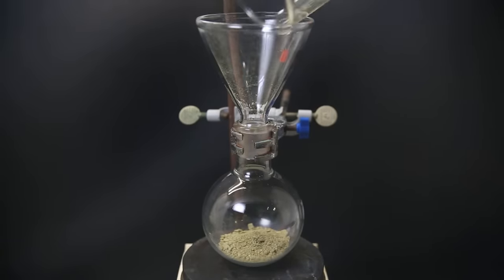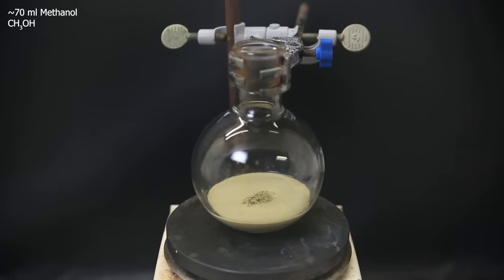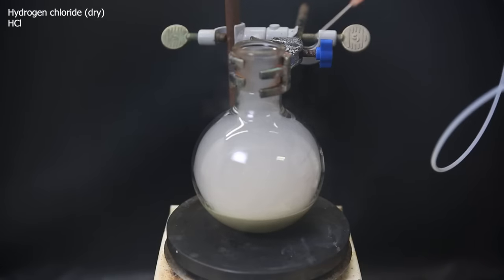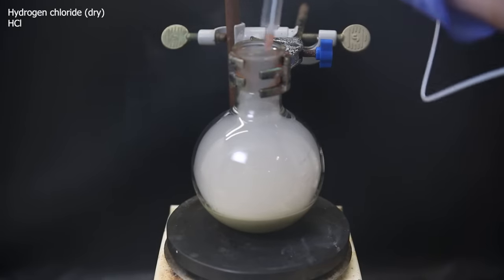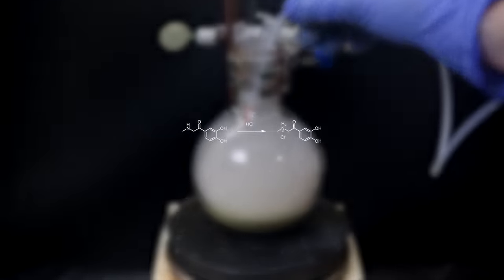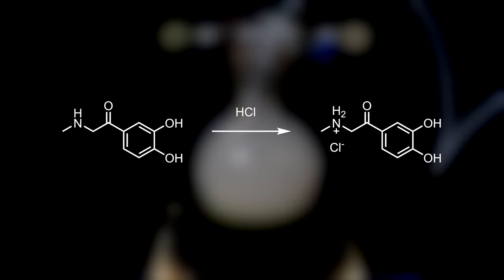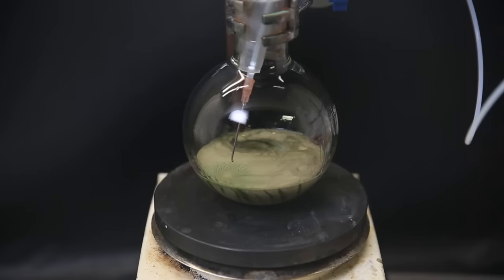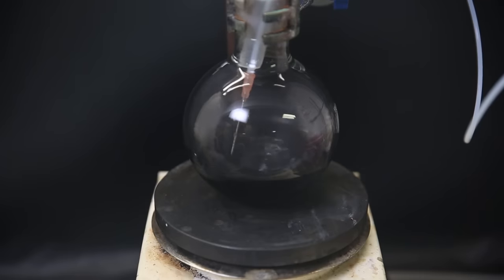I move it all to a flask again and add approximately 70 ml of methanol. I then blast the liquid with a stream of dry hydrogen chloride that is produced by reacting sulfuric acid and sodium chloride. In this reaction, the adrenaline is simply converted into its hydrochloride salt. When I turn off the stirring, we can more clearly see something is happening. After it has all reacted, everything has dissolved and the mixture is black.